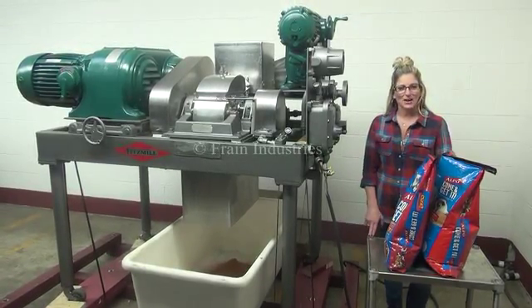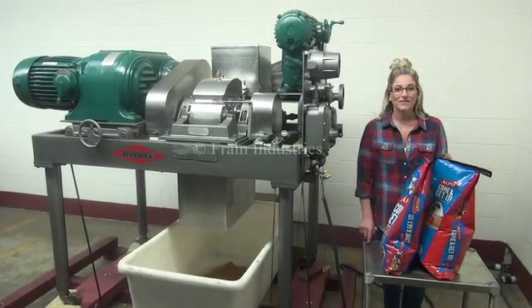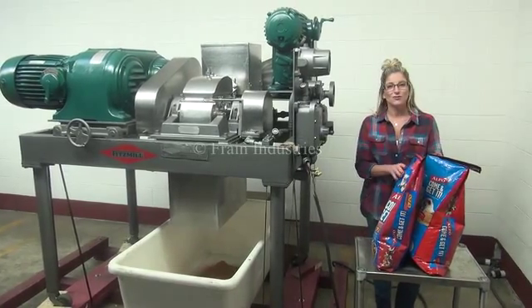We recommend you read the manual in its entirety before powering up the machine. The voltage is currently set to three phase, 460 volts. Today we'll be demonstrating the machine using this dry dog boot.